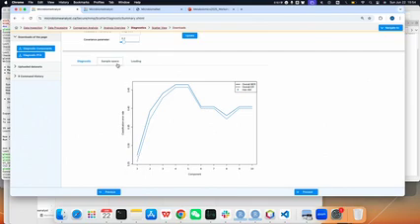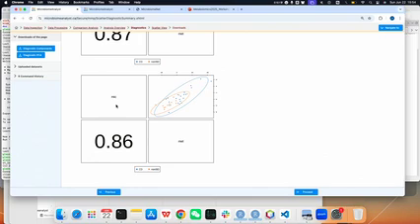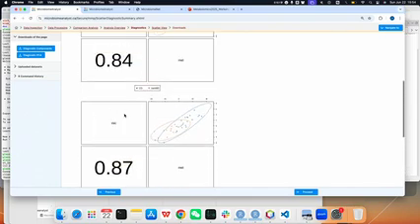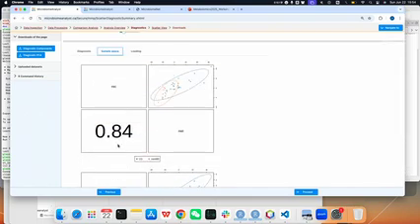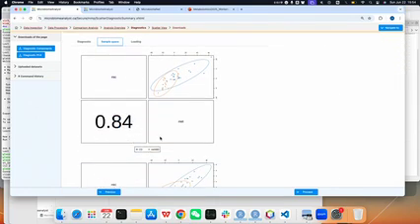And we can also see the sample space, for the top 3 latent components. And we can see the correlation is quite high here. So based on Diablo, we can see there's a very good alignment between microbiome data and metabolomics, which is different from the previous result.